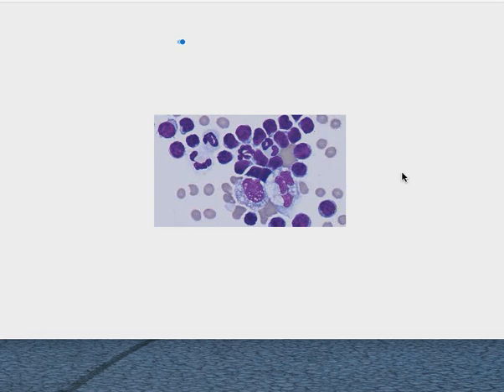These are red blood cells, and the normal mature lymphocyte is not a lot bigger than a red blood cell. So I'm going to call these normal lymphocytes. And there, we did it in class. So there's about 18 or 20 of them. So the question that you do need to ask when you report this out is, what is the predominant cell type in this cytology? Clearly, it's lymphocytes. So how I would report this one out is predominant cell type is lymphocytes. A few neutrophils and macrophages are noted. No bacteria seen. That's how I would note this.